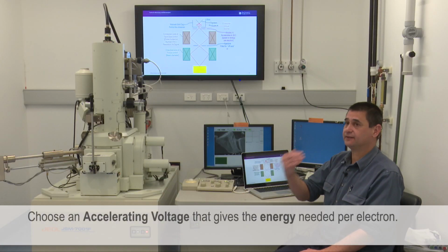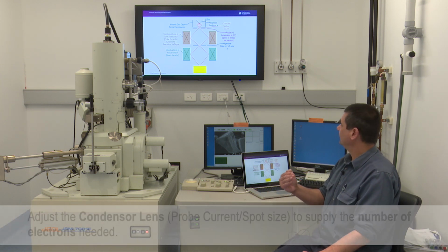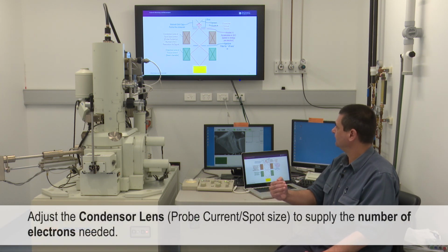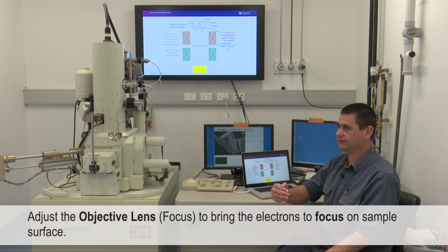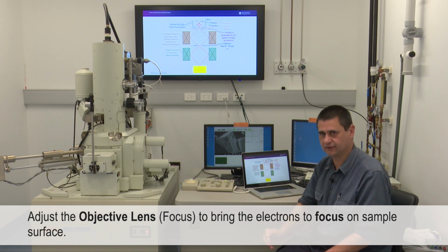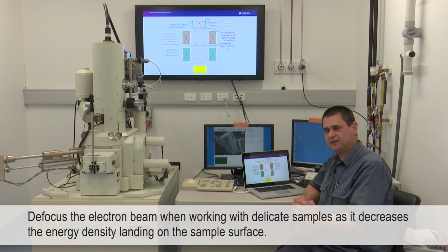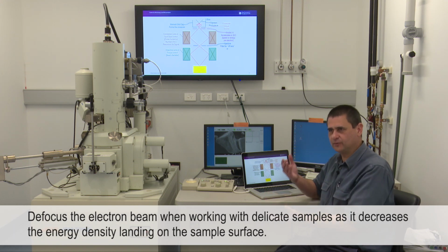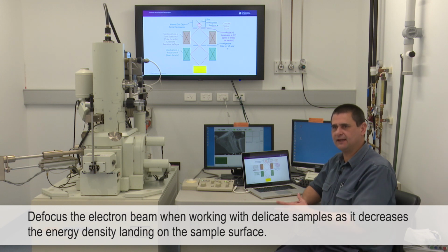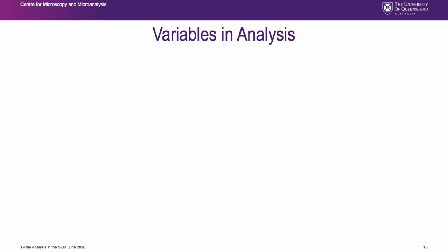Normally, I choose my accelerating voltage to give me the energy I need per electron. I then adjust the condenser lens to give me the number of electrons I need, and then I bring those electrons to focus on my specimen surface. Occasionally, I defocus my beam because I want to be gentle on a delicate specimen. But I still need all those electrons landing there, so I defocus and decrease the energy density on the specimen surface.